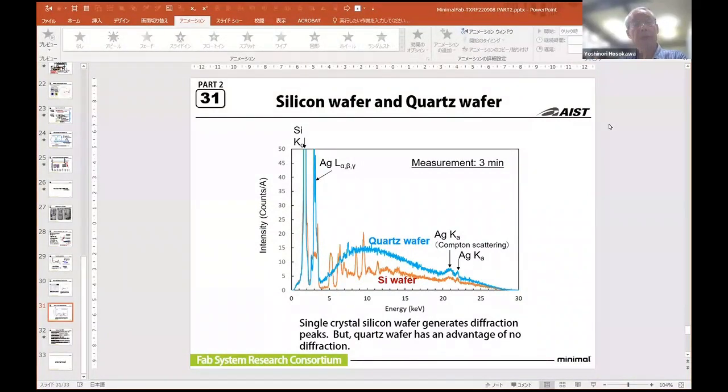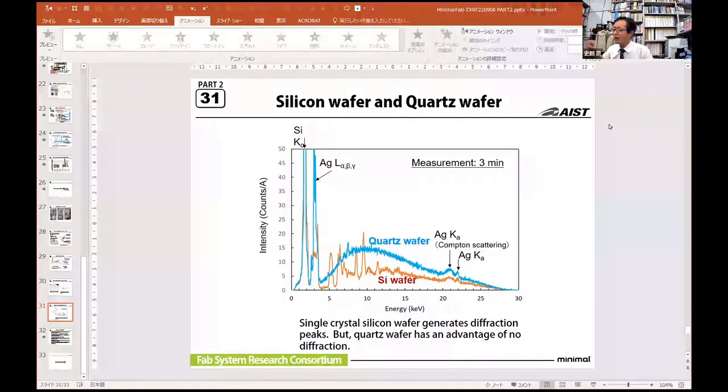How do you get the reference sample or standard sample? No, we don't use a standardized wafer of contaminants. We only use this wafer for various targets. So we only observe our daily used wafers. We don't use standardized contaminants on the wafer.